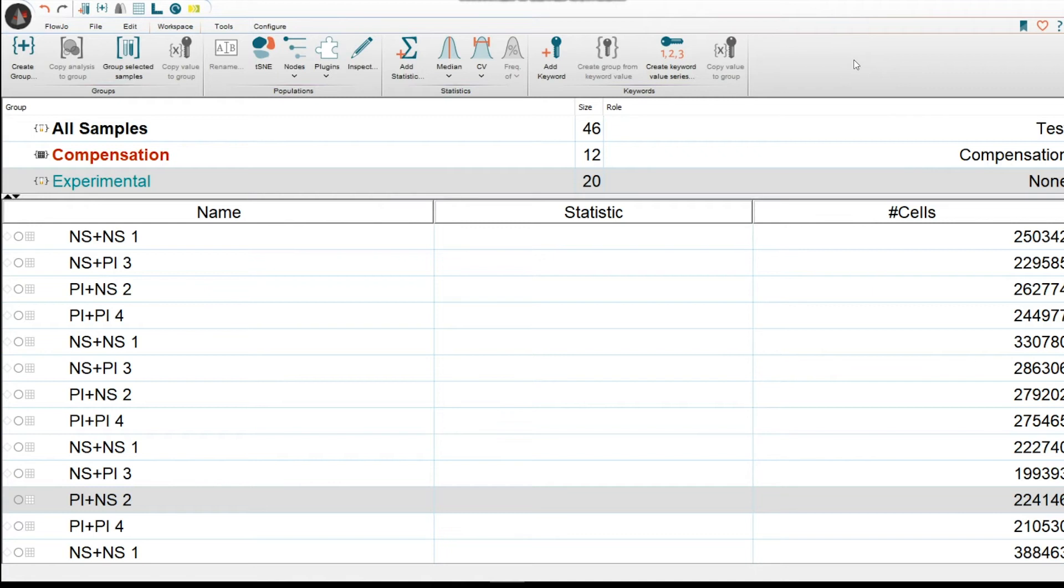With keywords in FlowJo, you could either view the keywords that you entered during the time of acquisition, or you could enter new keywords post-acquisition and during your analysis in FlowJo.